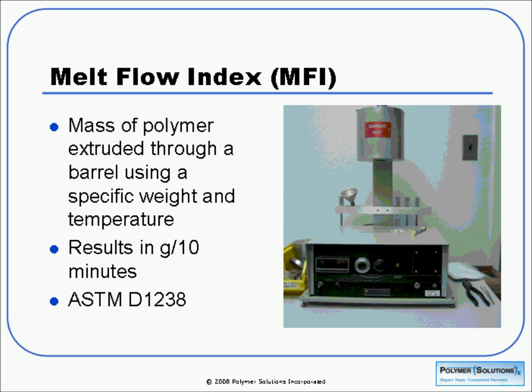Another common technique in the labs is melt flow index, or MFI. This is a fairly crude method, but it is quick and easy and useful for some quality control applications. It's a simple test where we place pellets or powder into a heated barrel. We put a specific weight on top, and we measure how long it takes for a certain mass of material to flow through a die.